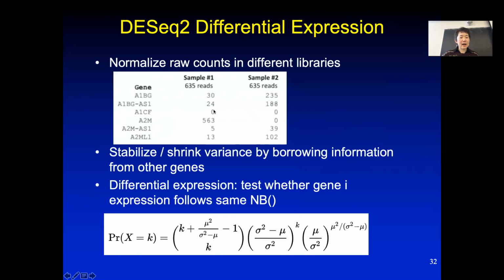And if one gene has a crazy expression level, it's going to suck up all the reads and the other genes don't really have a chance to get their reads. And so in RNA-seq, we do have to deal with this situation. If one gene is expressed too high, the other reads are all a little bit lower. It doesn't mean that the other genes are necessarily lowly expressed in one sample compared to the other sample.